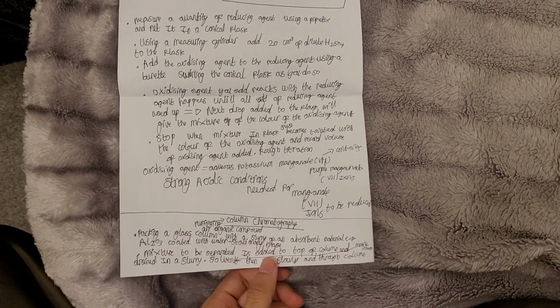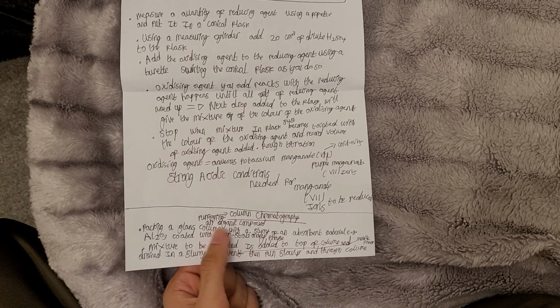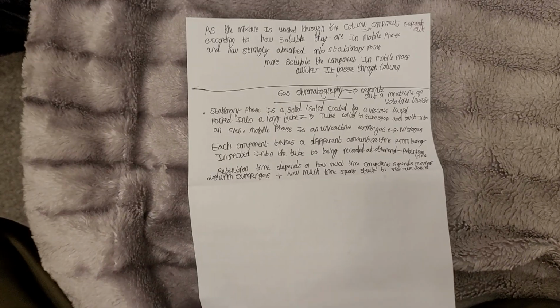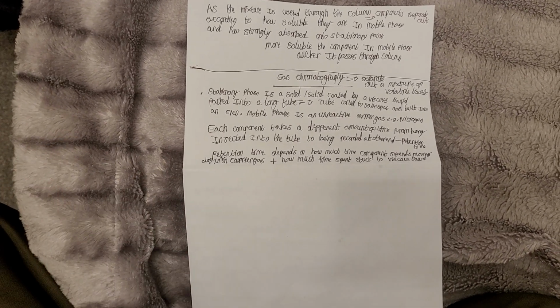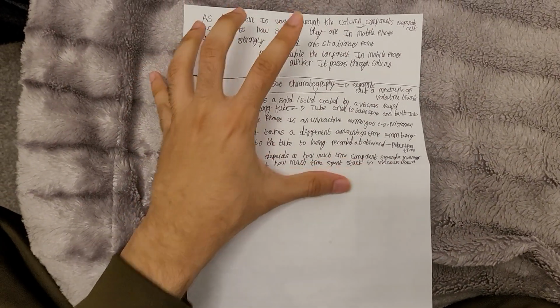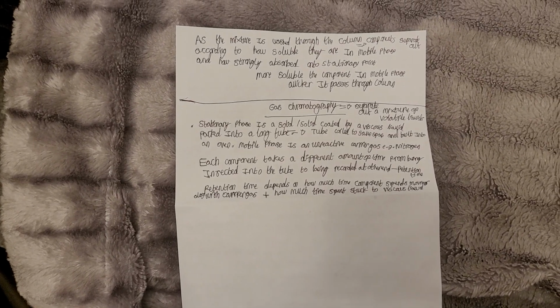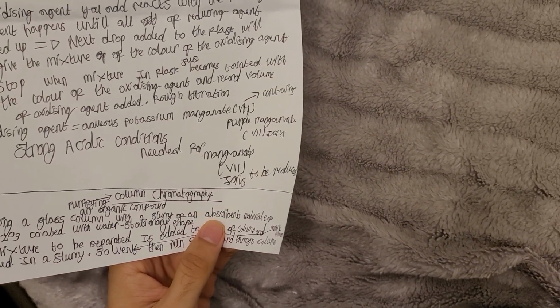It'd be like, state which chromatography is most appropriate, and if the student is purifying an organic compound, it's column chromatography. If the student is trying to separate out a mixture of volatile liquids, like a gas, where the molecules separate out, you're thinking, okay, gas chromatography, instead of column chromatography, which is used to purify organic compounds.